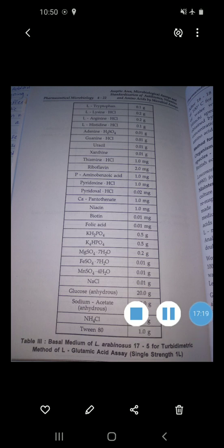Samples were collected by venipuncture before subjects received their mid meal. Then sera is stored at minus 20 and deproteinization was done by precipitation with acetic acid. Then for the assay procedure, 8 tubes were used, numbered 1 to 8, containing standard amino acid solution, 0.0 to 2 ml, that is 0.0, 0.2, 0.4, 0.6, 0.8, 1.2, 1.6 and 2 ml.